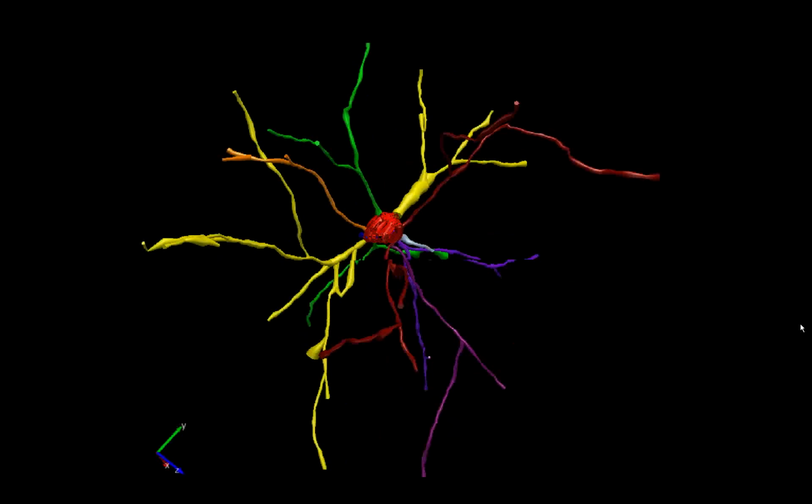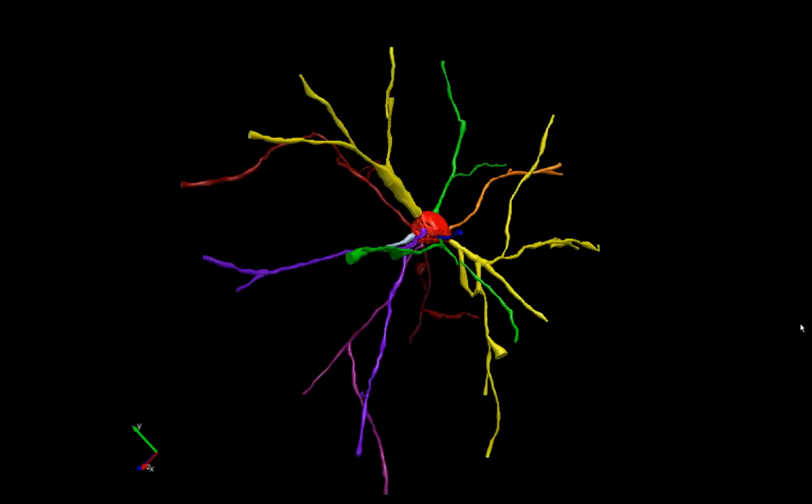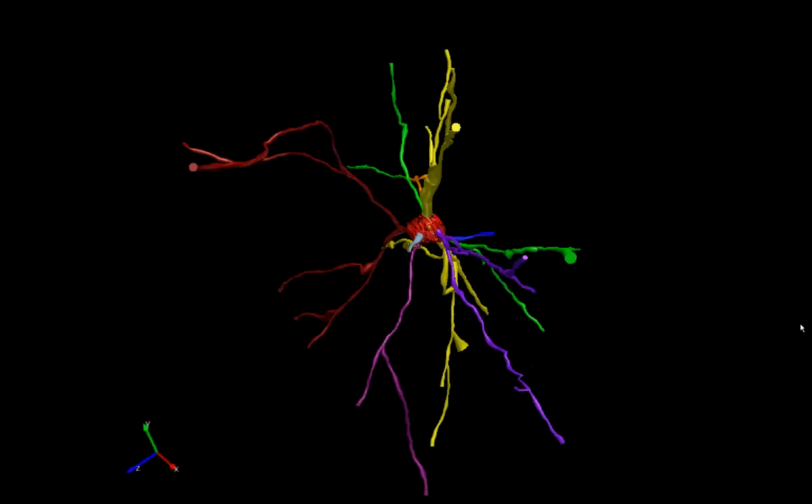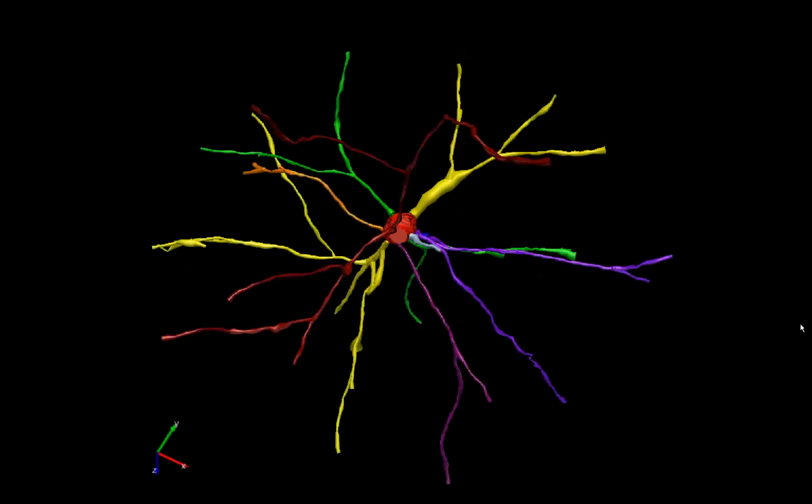Creating an accurate representation of cellular features can be used in a variety of ways to examine a multitude of experimental hypotheses. Just a few examples include terminal field analysis, where axons are traced across many physical sections, the analysis of individual spines along dendrites, and the creation of a wiring diagram or connectome. In addition to morphometrics, the reconstruction can be used to qualitatively demonstrate your point with 3D viewing.